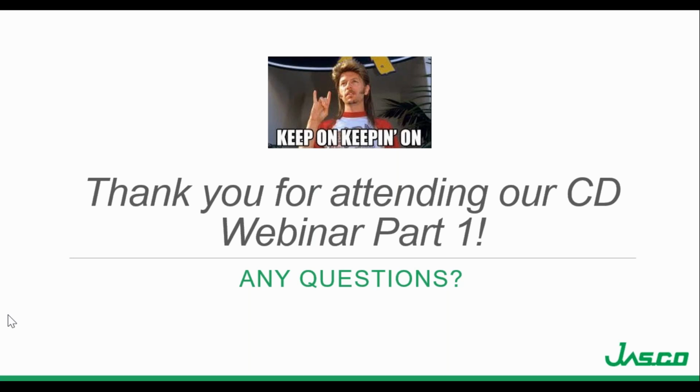What does it matter what buffer system I'm using? It definitely does. You want to, and I'll go into this again in the next webinar, but you definitely want to avoid using any salts if you can, because that's going to scatter and introduce noise into your signal to noise. If you can, use nothing that has a CD signal first off, so no sugars. If you can avoid using any highly absorbing buffers, if you're going to use, say, a phosphate buffer, just use a smaller concentration.